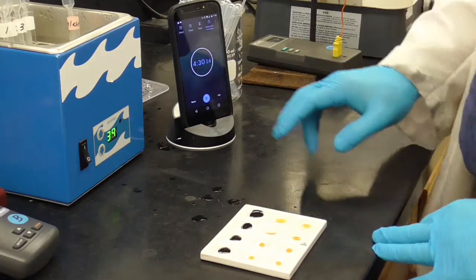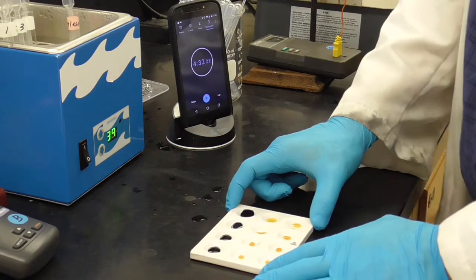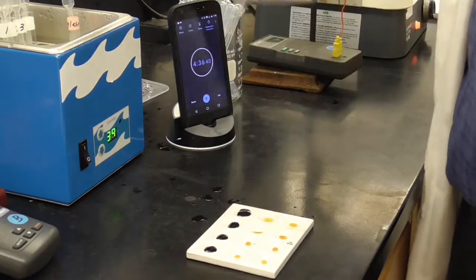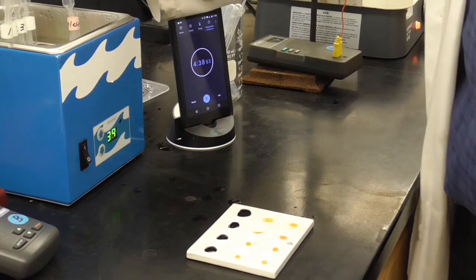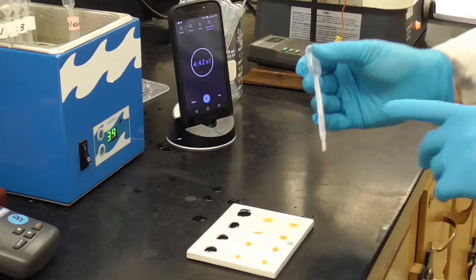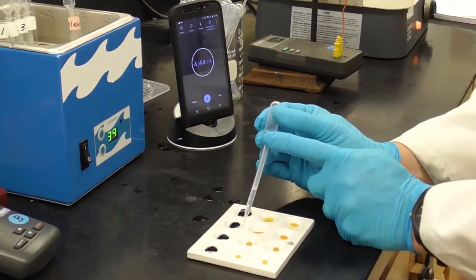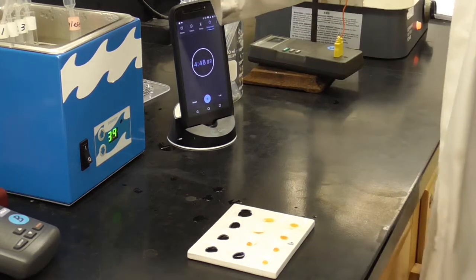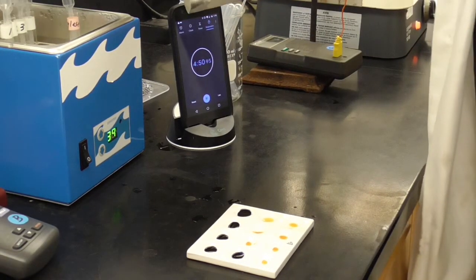Okay, here we're at 4 minutes and 30 seconds, which is our 5 minute mark. So we'll use the second row this time, and we'll do the same thing. We'll add 4 drops and see if there's a change. So first, tube 1, where we put no enzyme at all. 1, 2, 3, 4. Yep, that starch is still present, just as we kind of expected.